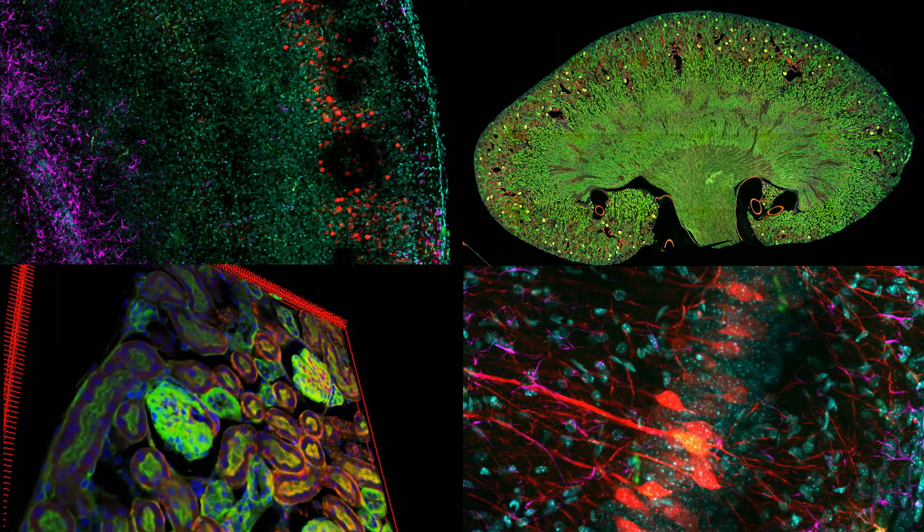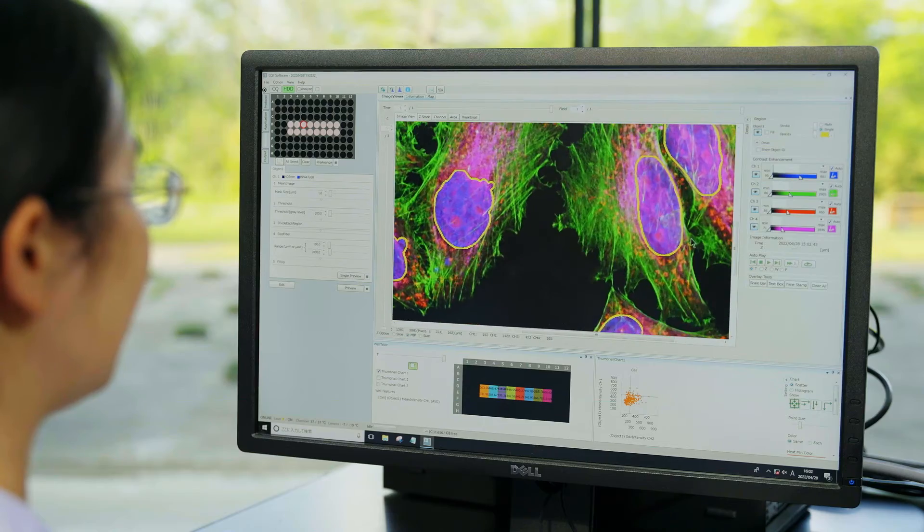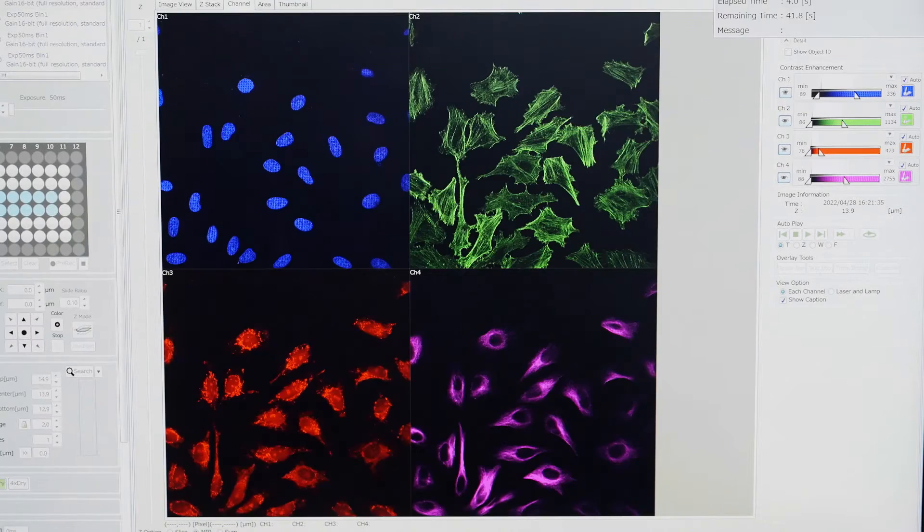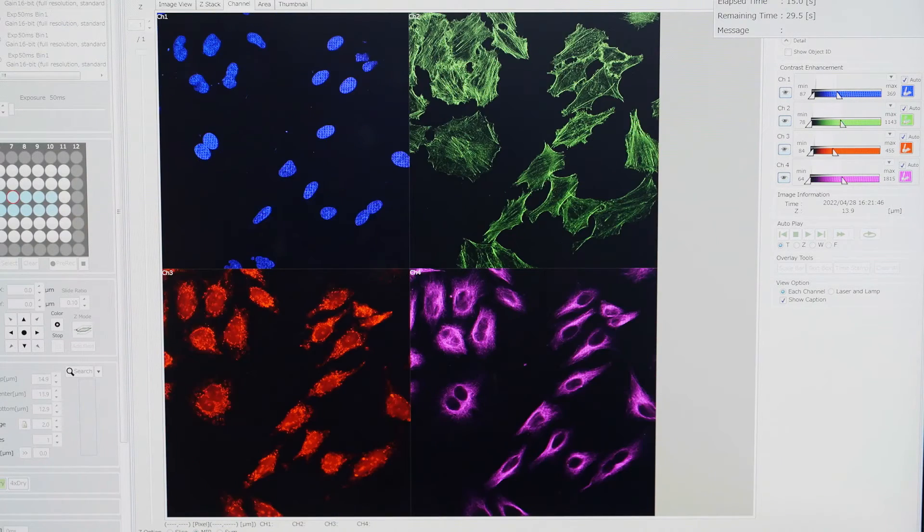Acquired images can be automatically analyzed by powerful image analysis software to provide comprehensive quantitative data about the target cell features.